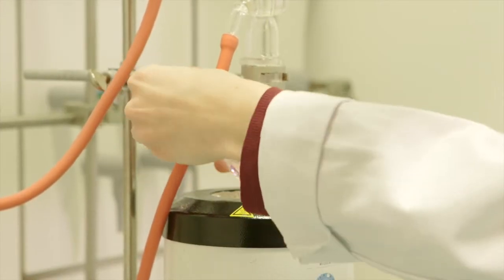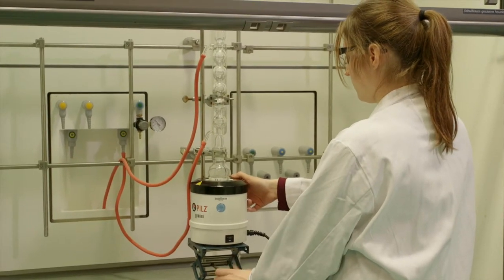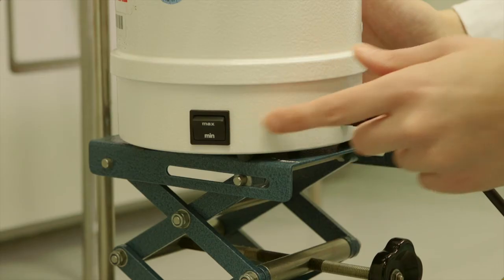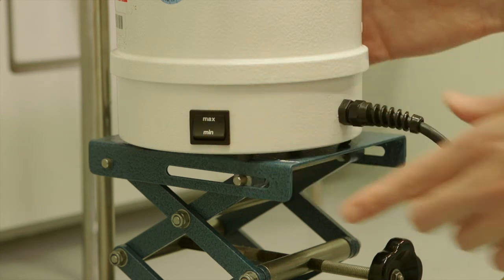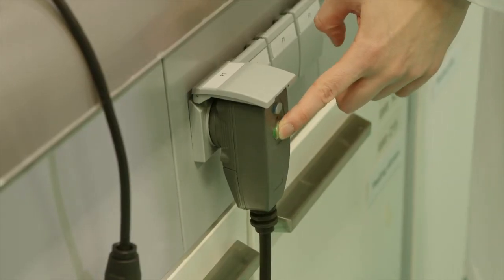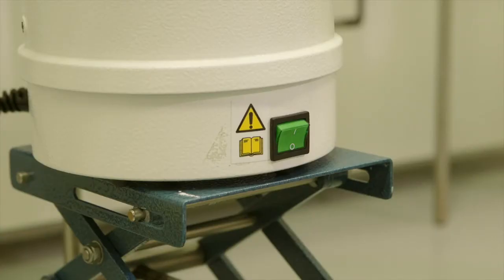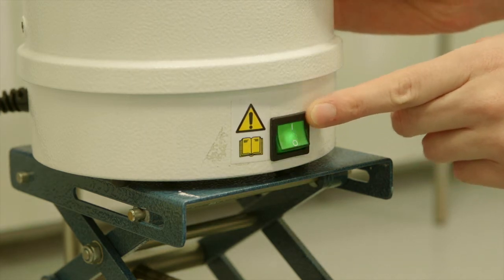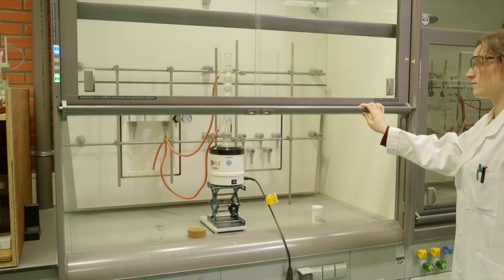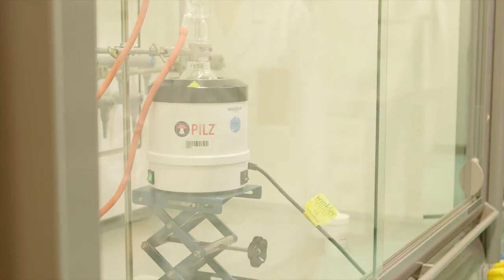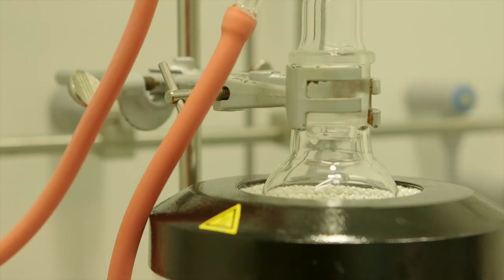When everything is attached again, adjust the settings of the isomantle. Adjust the setting to minimum for gentle heating and to maximum for fast heating. Press the green button on the plug and turn on the green button on the isomantle. Your reaction will be heated now. The process in which the first vapor condenses and runs back into the flask is called reflux. Start timing from that time point.